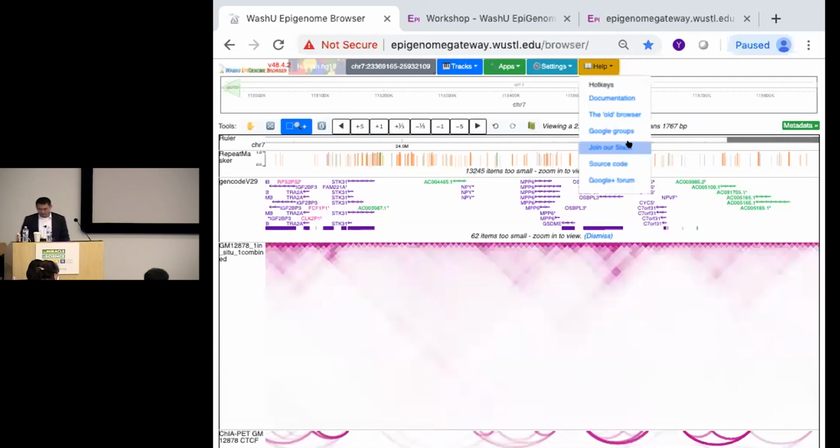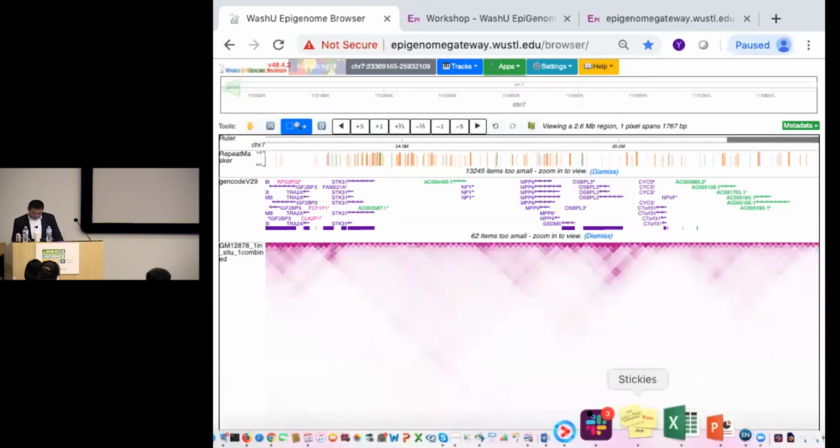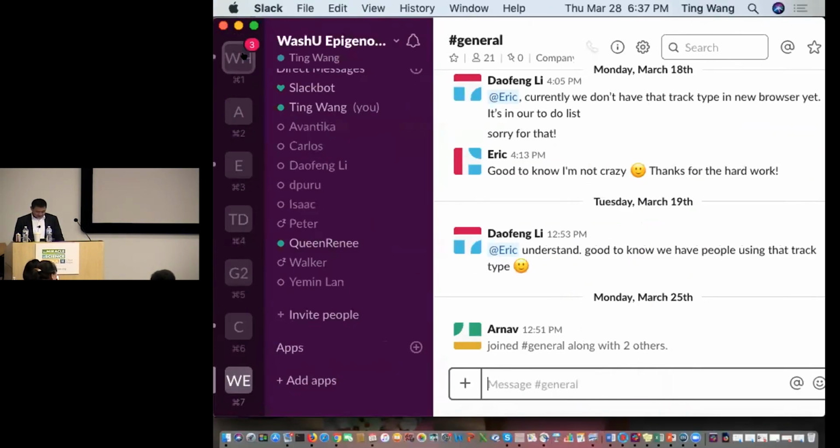Yeah, the comparative track. Where is it? Comparative. I don't even remember. I didn't prepare this part. Can you Slack it now? Asking your group could show us your group is responding to questions. Sure.